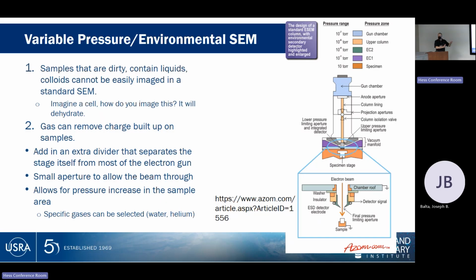Now, in my design for my electron microscope, I have to do something particular here, because if I'm going to leave my stage at an elevated gas pressure, I can't have that gas pressure get all the way into my gun column, because the longer the gun column has more gas molecules in it, the more electrons get used up in the column. So typically to do this, there is some version of another aperture here that will limit gas flow upwards into the gun to make this work.